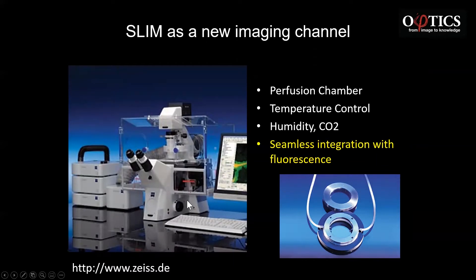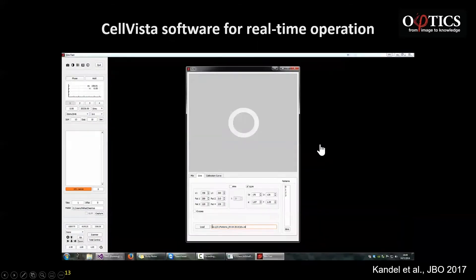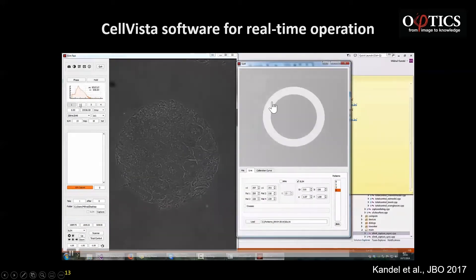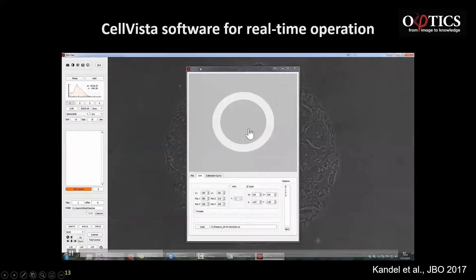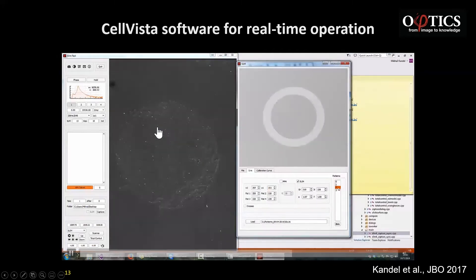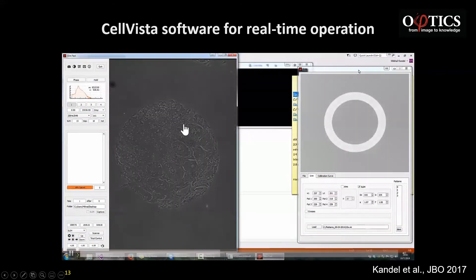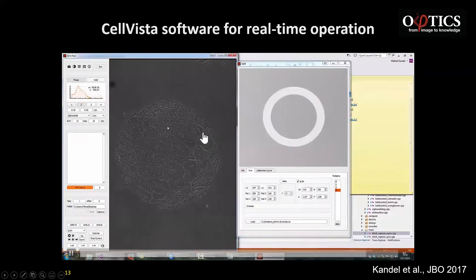Because you can add the SLIM module to an existing microscope, you already have all the accessories for temperature control, humidity control, perfusion chambers — it integrates with fluorescence on the same optical path, and you can alternate between the two. The Cell Vista software does all this processing in real time, some on GPU, some on CPU — what you see is a real time SLIM image. You can scan very large fields of view, multiple well plates. Here is a mesh of about five by five fields of view — you can't even tell where they were stitched because the background is almost perfect.